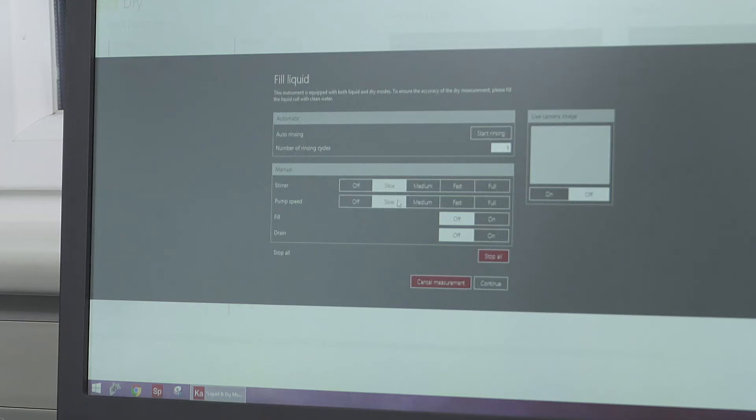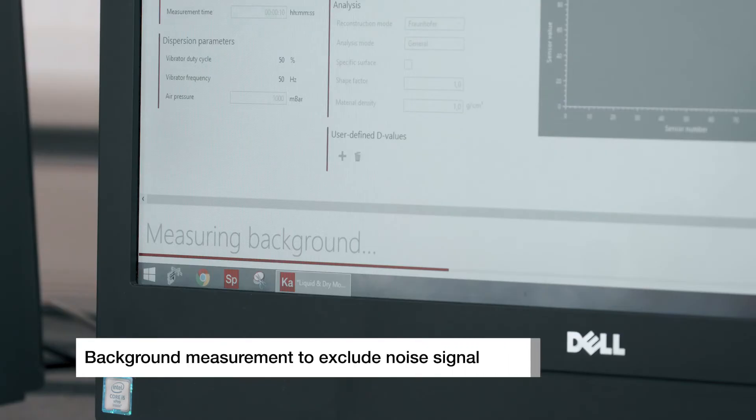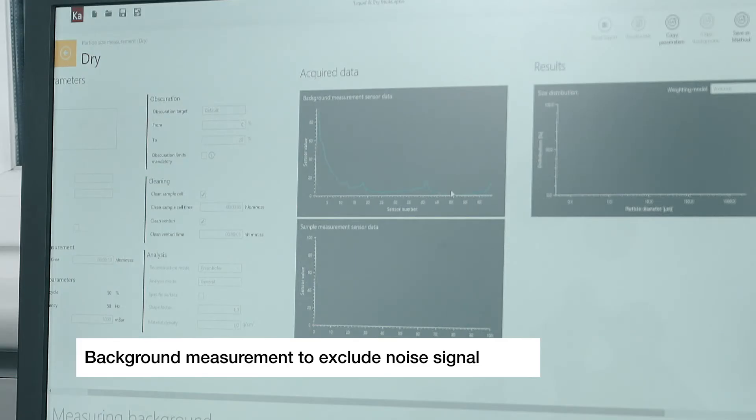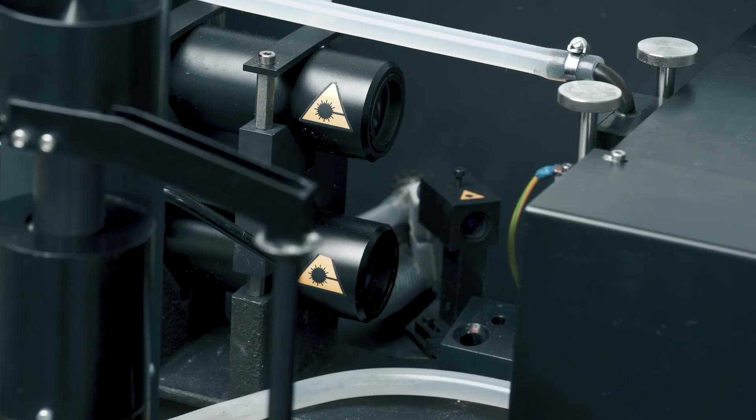Before the sample measurement is started, the background is recorded in order to exclude the noise signal. There is no realignment of the laser needed or warm-up time, as PSA uses robust and permanently aligned solid-state lasers.